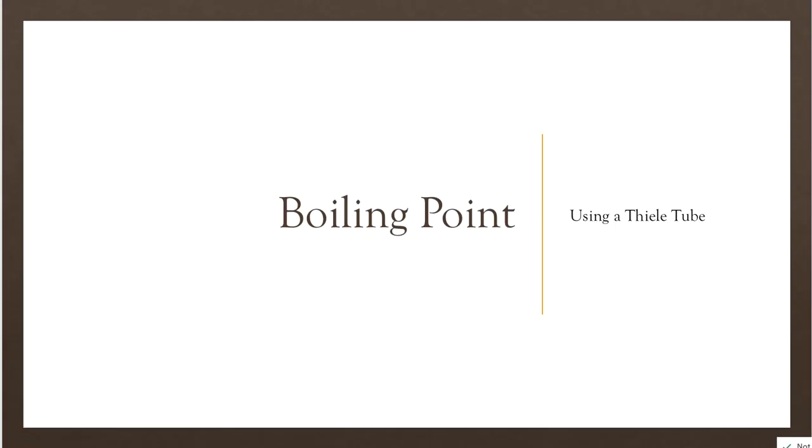All right, so my final test now is going to be my boiling point. And we're going to deviate a little bit from what the laboratory procedure is going to tell you to do with boiling point. They want you to do a simple pot distillation, and I just don't feel comfortable with that, right? So there's a simpler way to do boiling point. That's all that we need for this lab. Nothing major, no big deal, and that's using something called a Thiele tube. So I need to show you a Thiele tube.